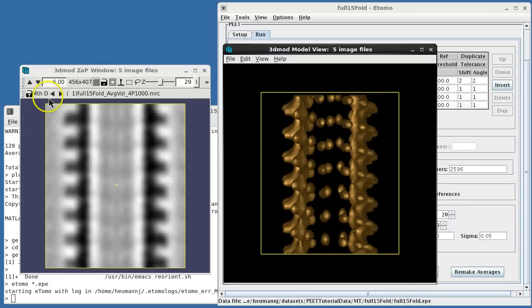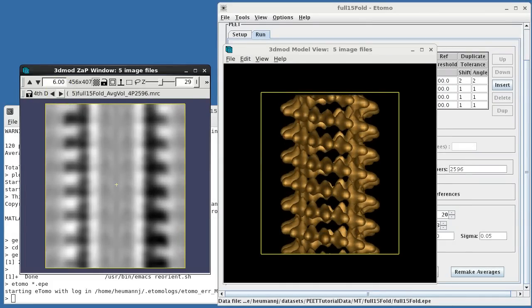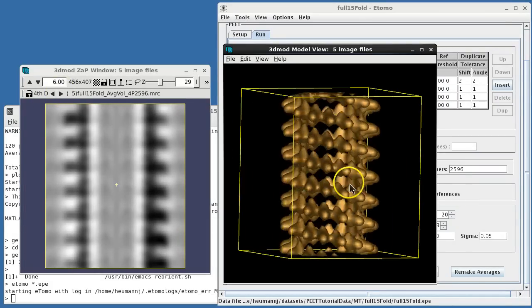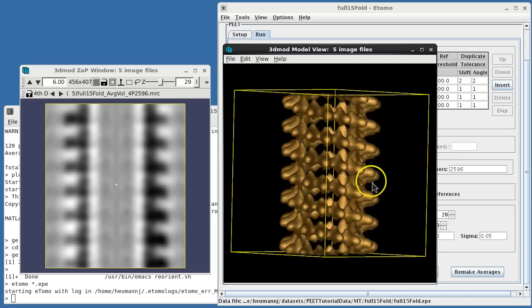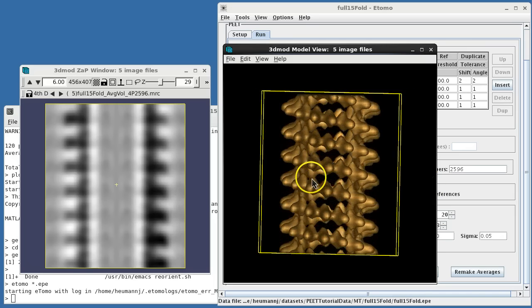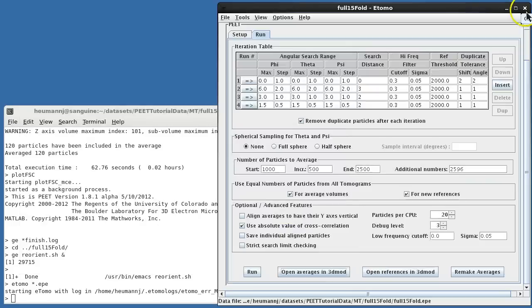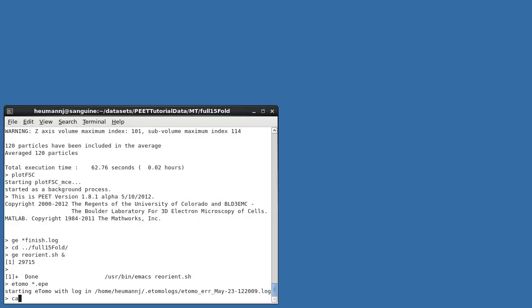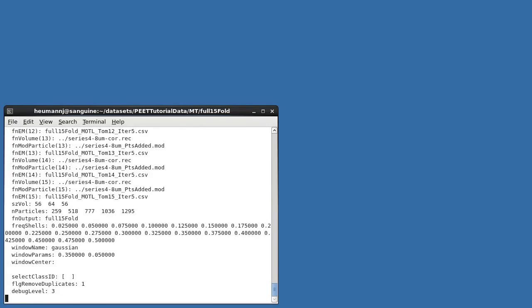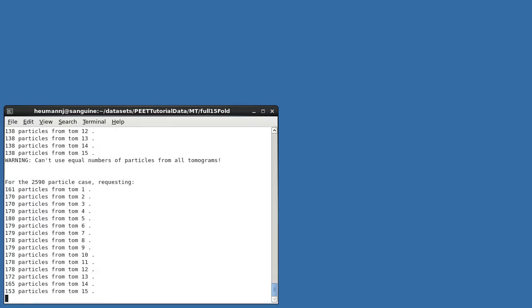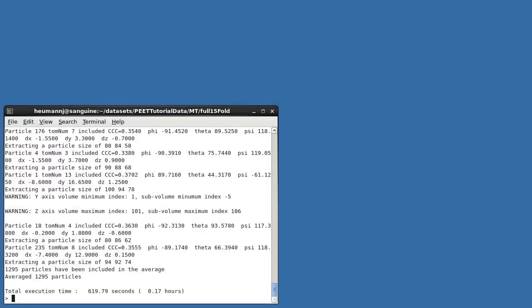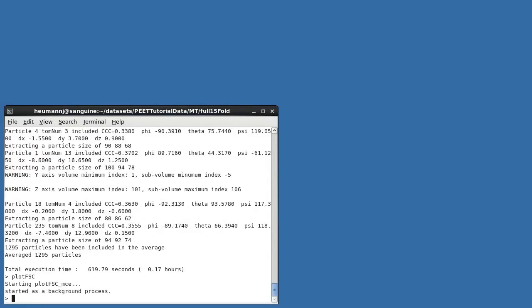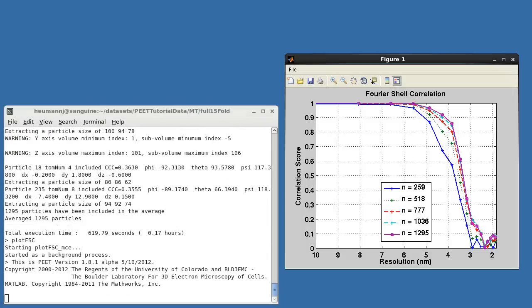Opening the symmetrized averages, we see that smearing from missing wedge bias is now further reduced, and the resulting averages are nearly symmetrical. Fourier shell correlation also indicates improved resolution, and now shows 50% response at around 3.4 nanometers.